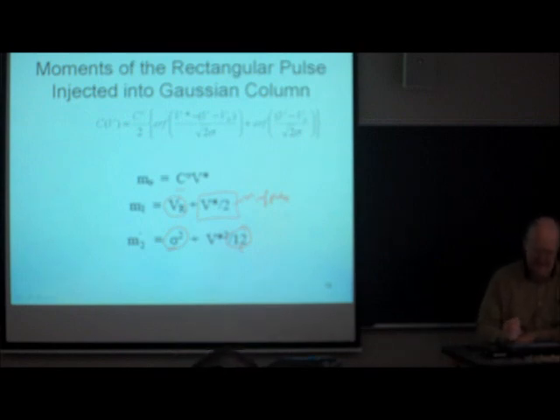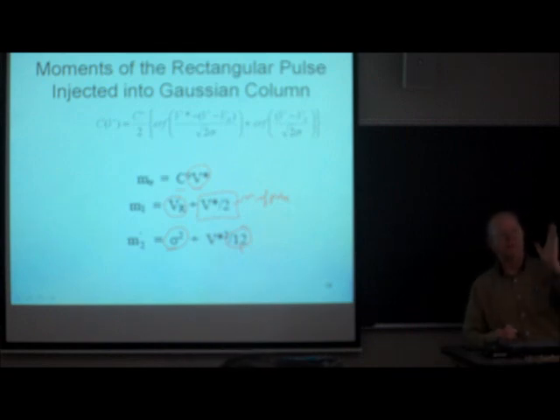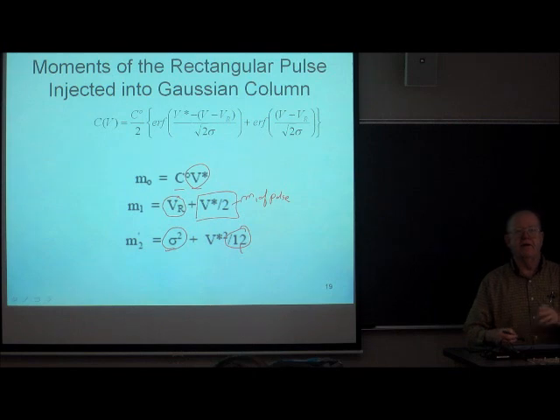So, what have we learned? If I increase this, my area gets bigger. You saw that when I drew all the curves. If you increase the injection volume, the peak V star, the peaks get wider.